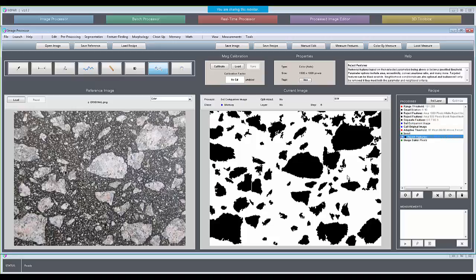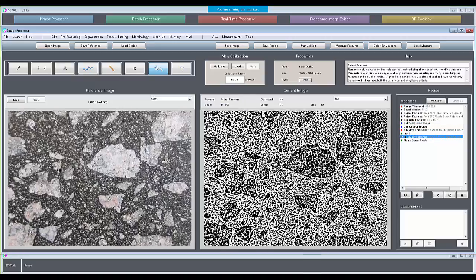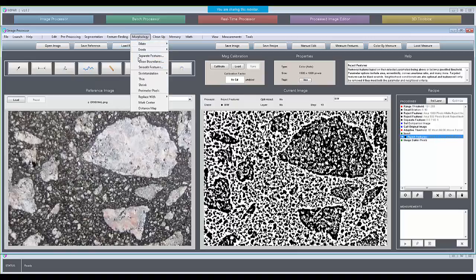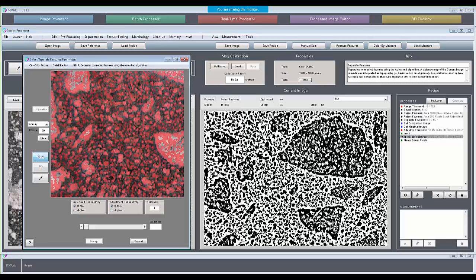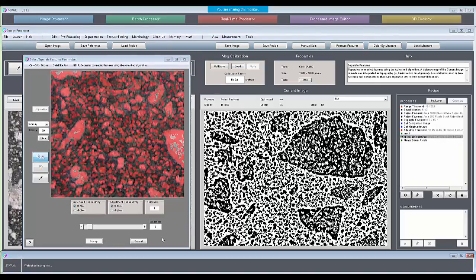And now we're down here where we have the finer ones, and I'm going to go after them probably with a different weakness setting than we did the bigger ones. So let's try 2. Maybe even 0.7. Usually finer features like this need finer, much higher strength separation values.